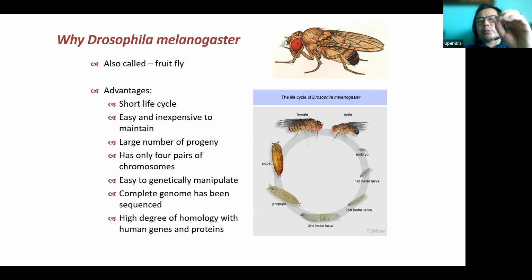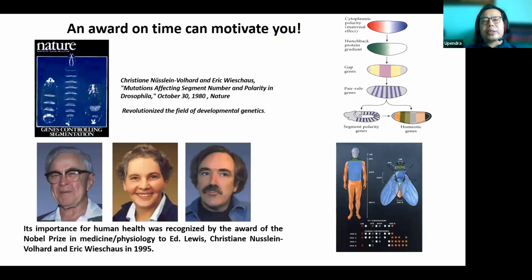Okay, but what people have generated is that if you have a mutation in a specific gene, you can't have eye or leg or wings. But that doesn't tell you how exactly those gene products are required for the dynamic development of these organs, right? That is what microscopy and live imaging can do.